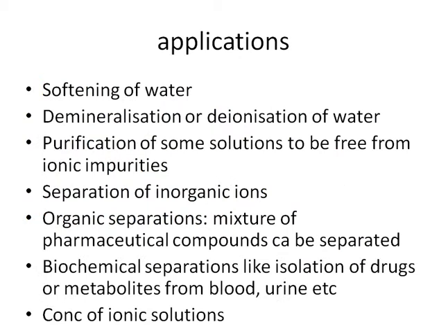Some of the applications are softening of water, demineralization or deionization of water, and purification of solutions containing ionic impurities. Also separation of inorganic and organic mixtures, and mixtures of pharmaceutical compounds can be separated. Biochemical separations include isolation of drugs and their metabolites from blood and urine, and concentration of ionic solutions.